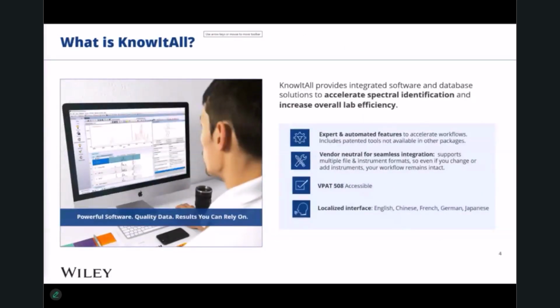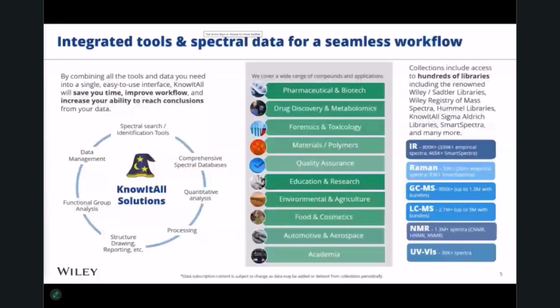But what is KnowItAll? KnowItAll is a software solution that gives you tools to identify, analyze, and manage your analytical data for the purpose of increasing lab efficiency. KnowItAll is designed to work as you do, so you can move seamlessly from task to task without having to leave the interface. The power of KnowItAll software is how versatile it is.